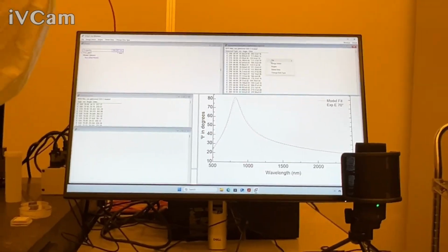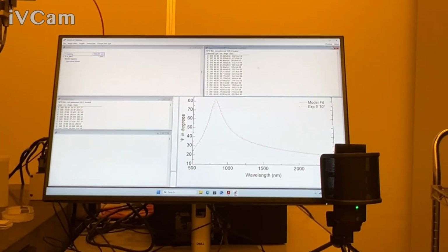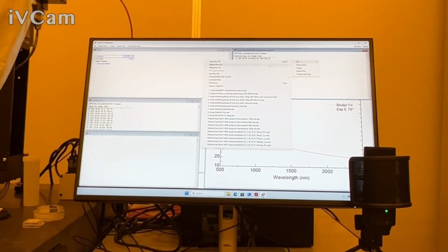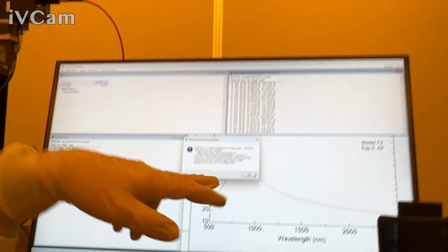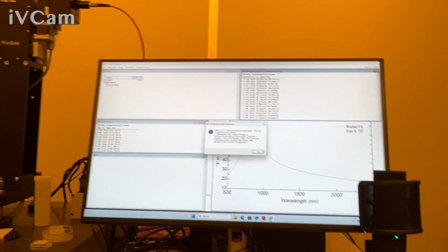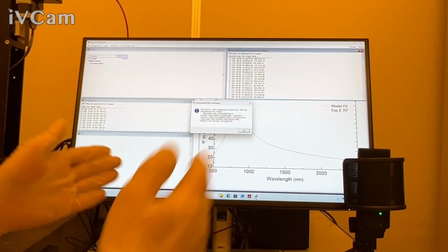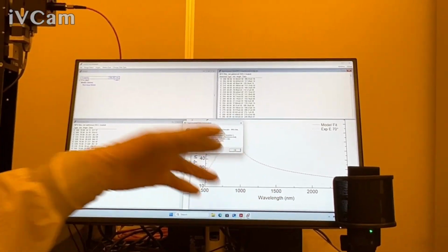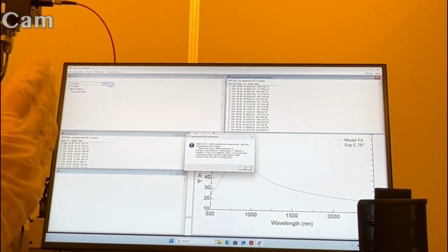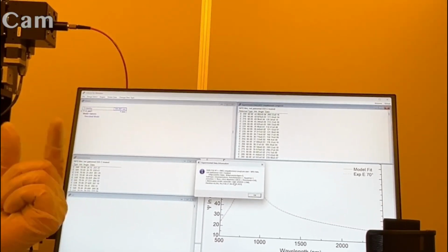bandwidth. Now there's not a lot of bandwidth here. If I go to the file information, I can see what our slit was set to: 1,000, so that's essentially a 1 millimeter slit, 1,000 microns. On the main, that's probably a little bit more here because we measured out to these longer wavelengths, but the primary grating, it's 2.3, 2.4 nanometer bandwidth per 1 millimeter slit.